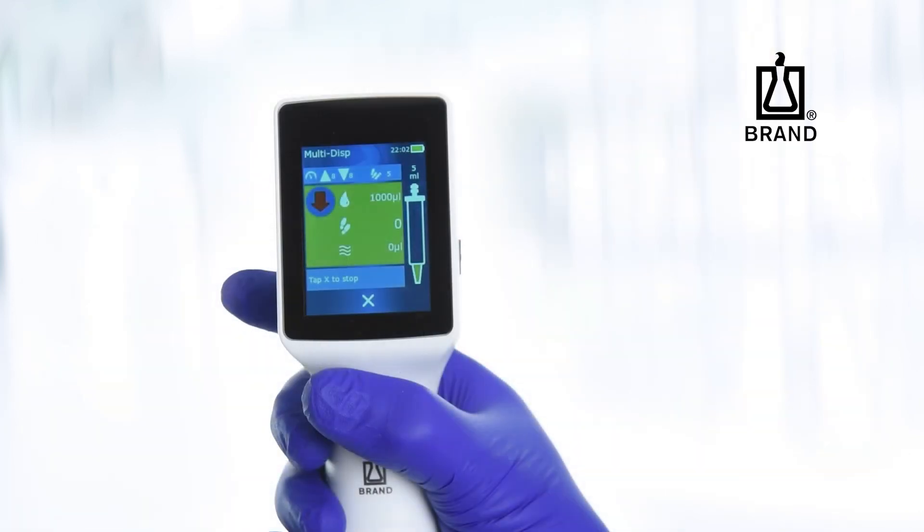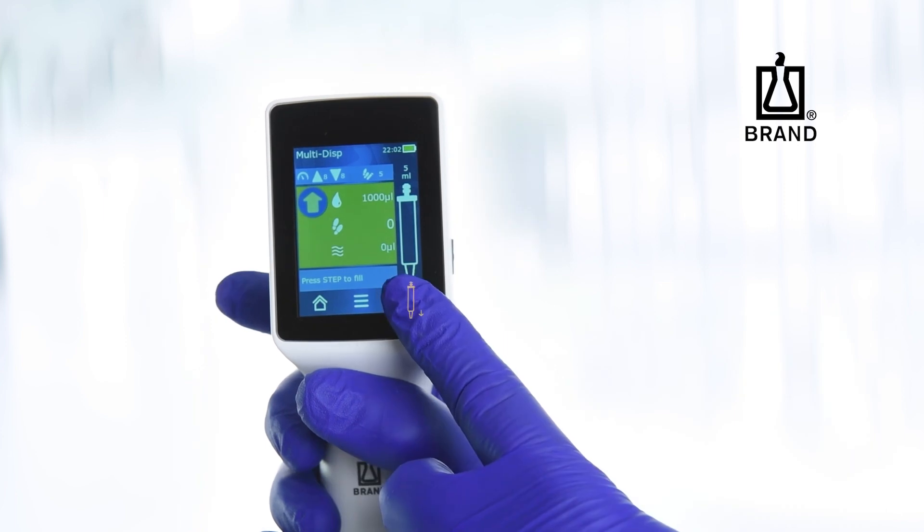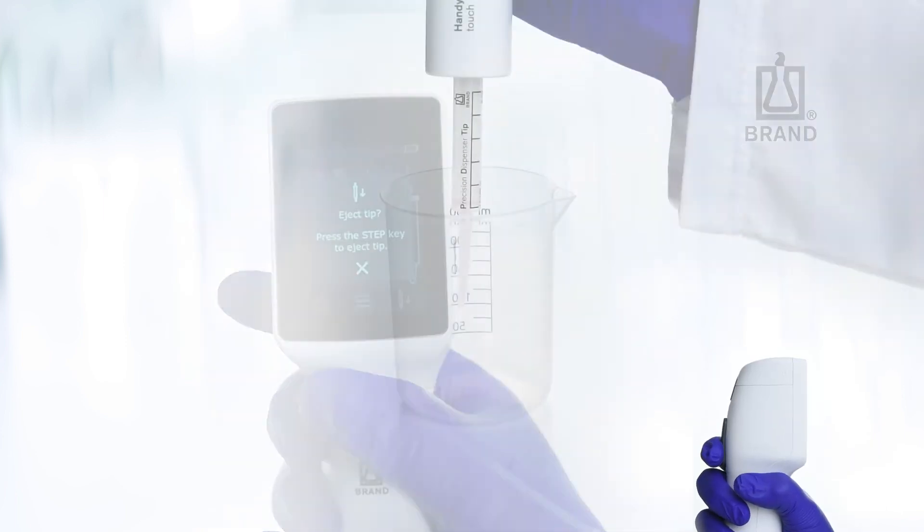When finished dispensing, purge or empty the PD-TIP by holding down the step key for several seconds. Tap the tip ejection icon and press the step key to eject the tip.